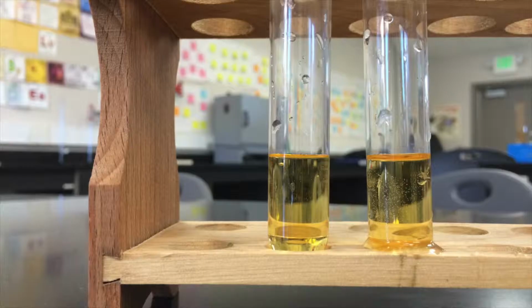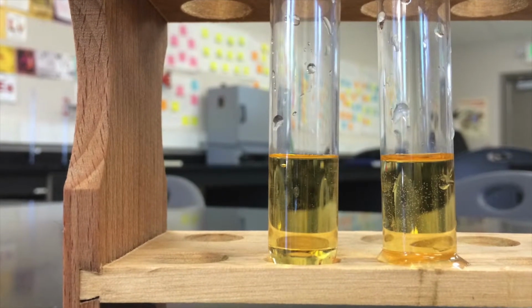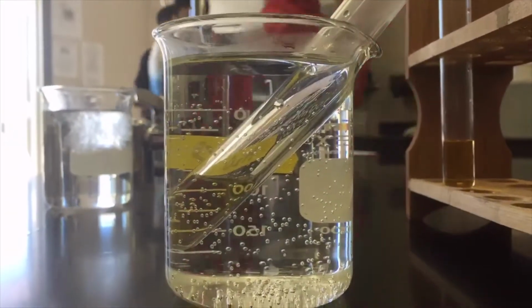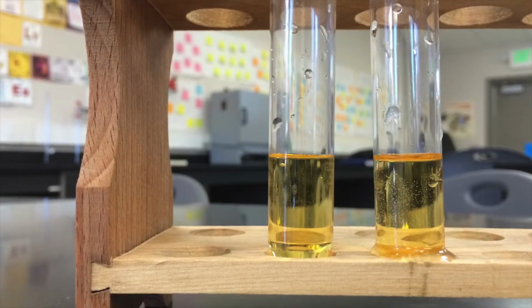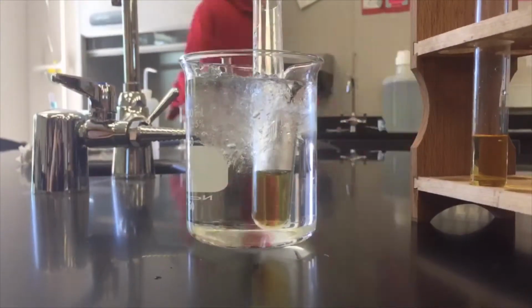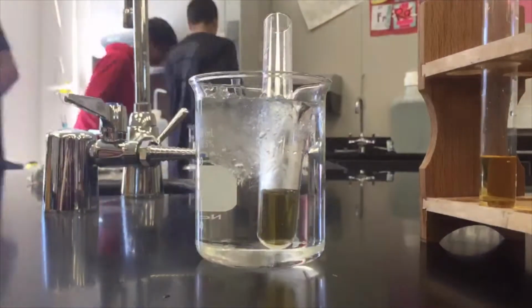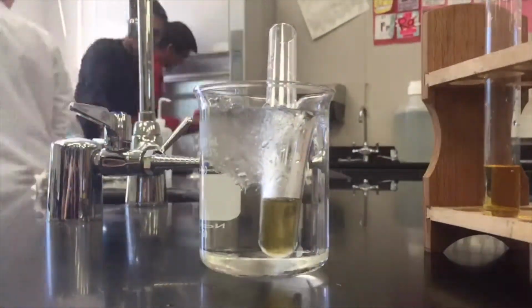First, we created two identical test tube solutions containing HCl, NaOH, and indicator. One will act as the control. Next, we placed the experimental tube in a hot water bath of 70 degrees Celsius. After 3 minutes, we compared the two tubes and found that there was no change. Then, we placed the experimental tube in an ice bath. After 3 minutes, we compared the experimental to the control, and there was again no change.